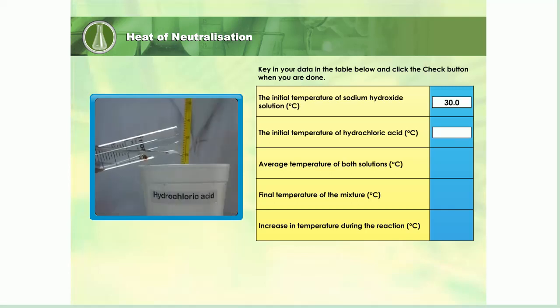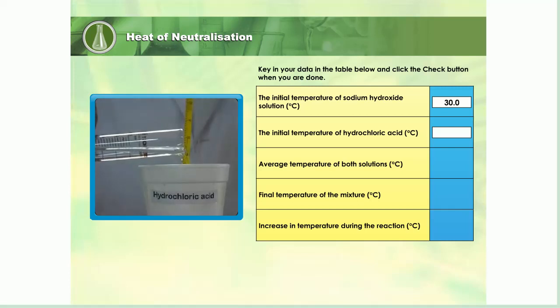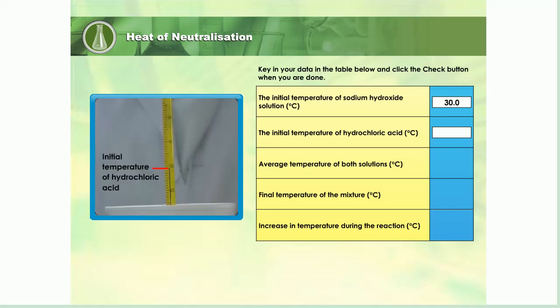50 cubic centimeters of 2 mole per cubic decimeter hydrochloric acid is poured into a polystyrene cup. The initial temperature of the solution is measured with a thermometer. Record the reading. Calculate the average temperature of both solutions.